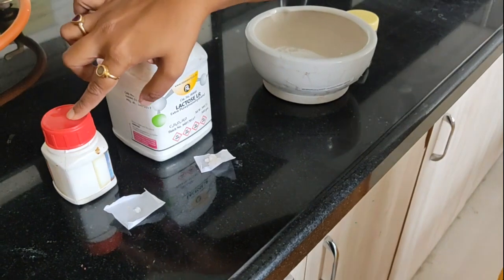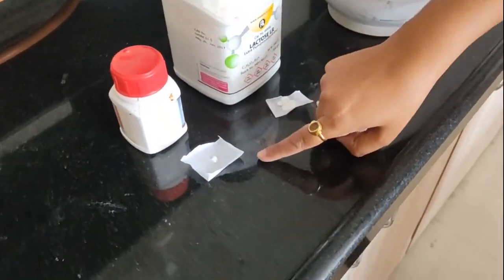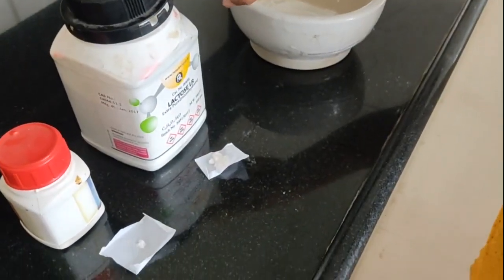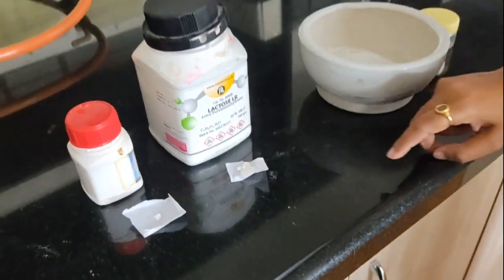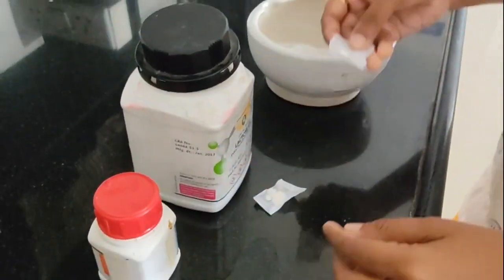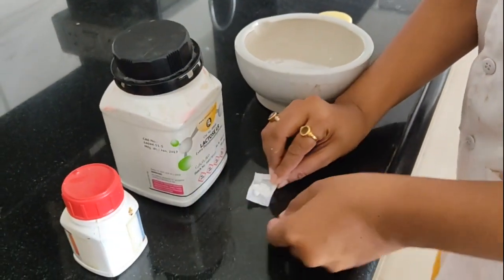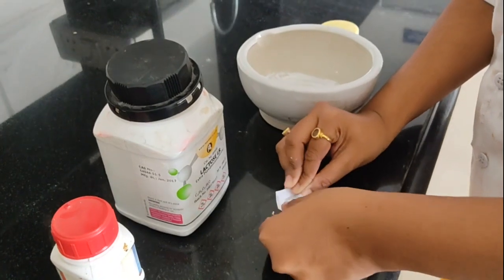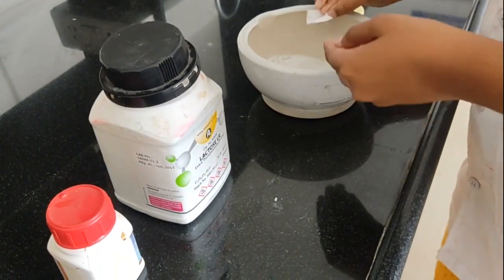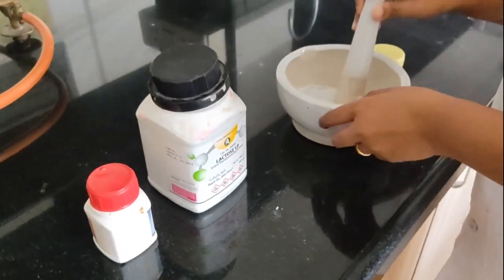We have codeine phosphate, which we previously read. As we know, this is a potent drug, so it should be used in a small quantity. This is lactose, which is used as a diluent. First of all, I am going to take this codeine phosphate into this mortar and pestle, and after that I am going to add a small quantity of this lactose into it, and then proceed for trituration in this mortar and pestle.